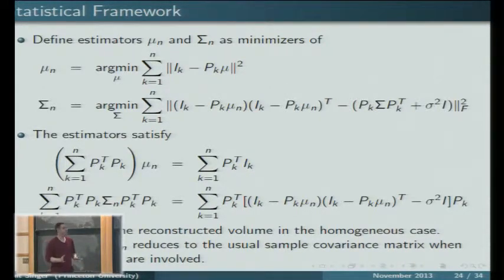But even if it was not a problem in tomography, even if you are talking about a completely different data set, where the data that you observe is just projections of some underlying true physical features, and you observe the data through some lens that does not allow you to see the entire features, but only a few of them or some linear combination of them, you can still end up with this linear equation from which you can estimate sigma. This is related to what people sometimes call matrix completion: I see only a few of the matrix entries and somehow I can fill in the entire matrix.